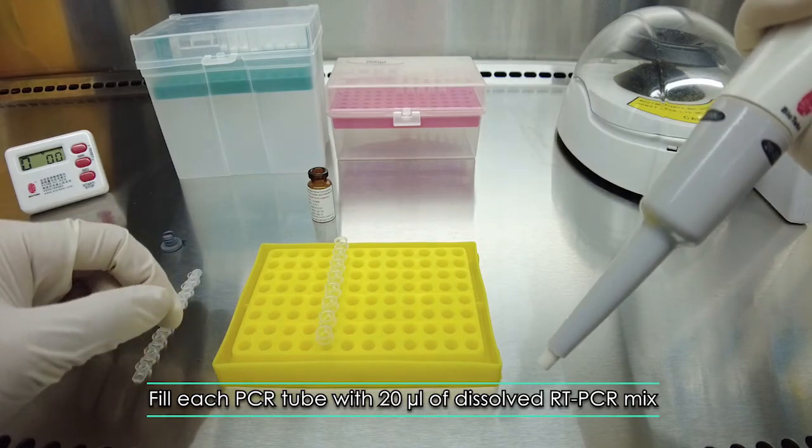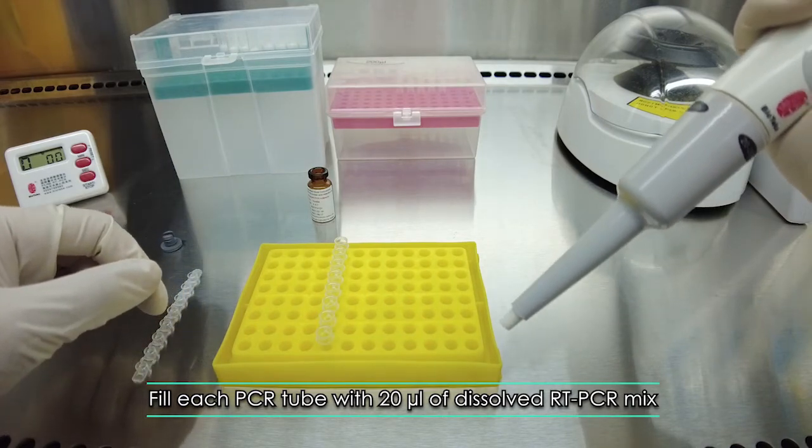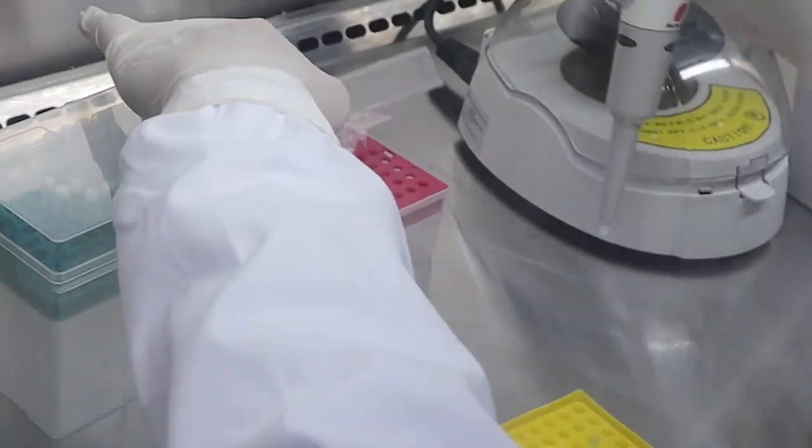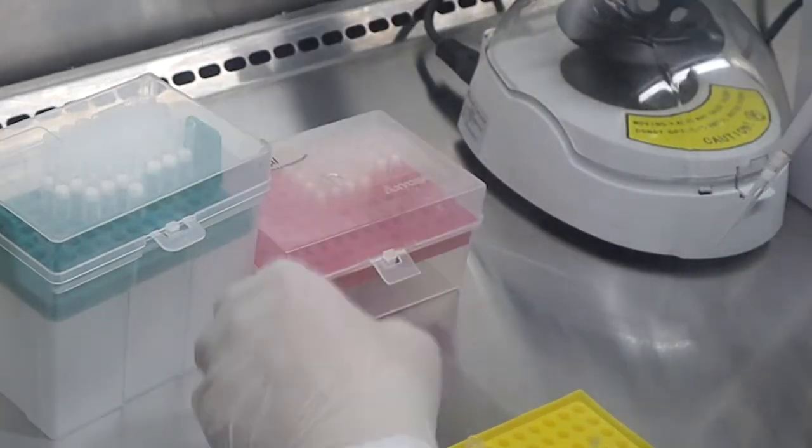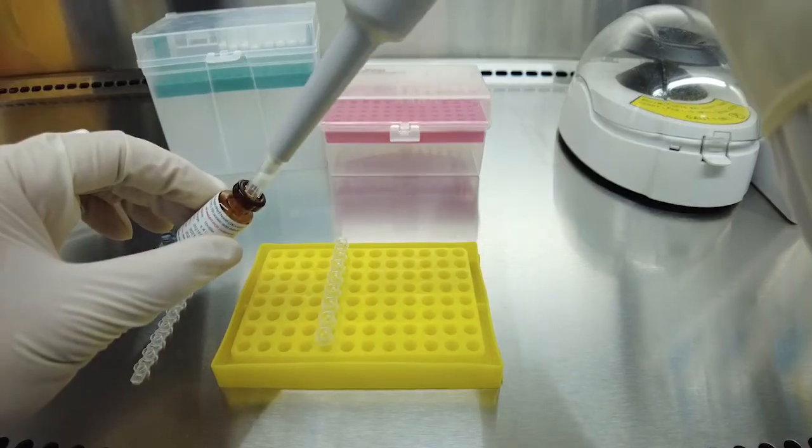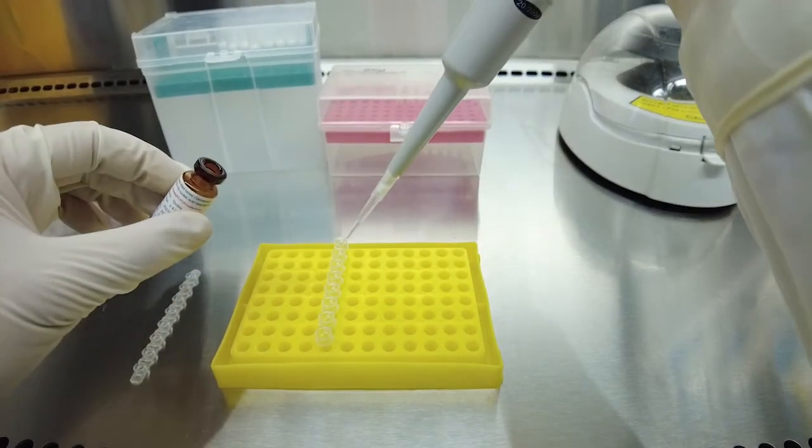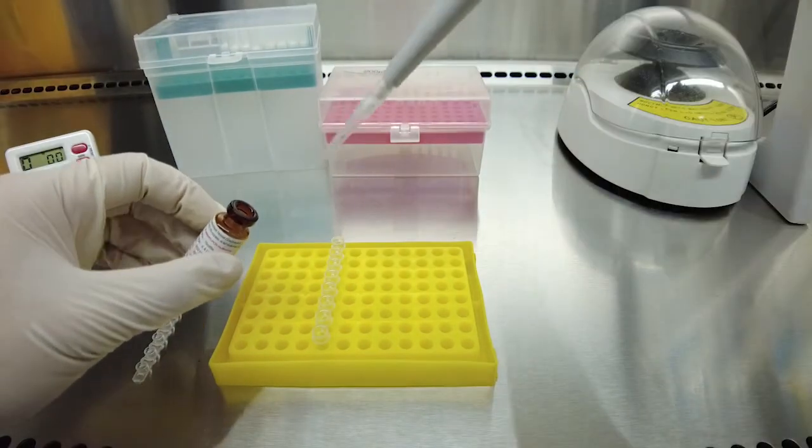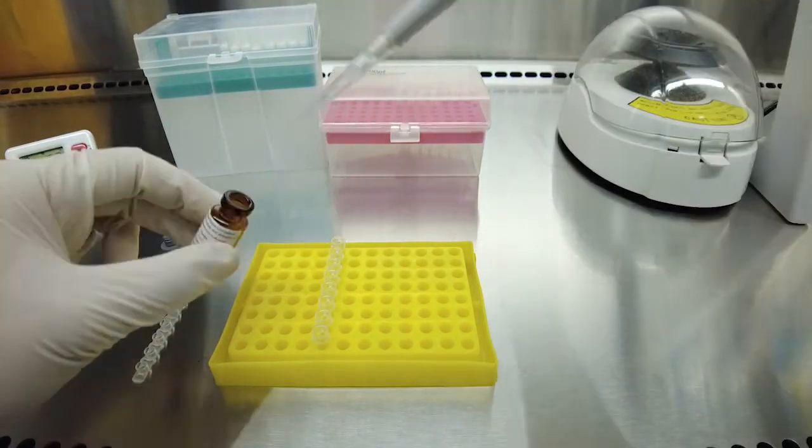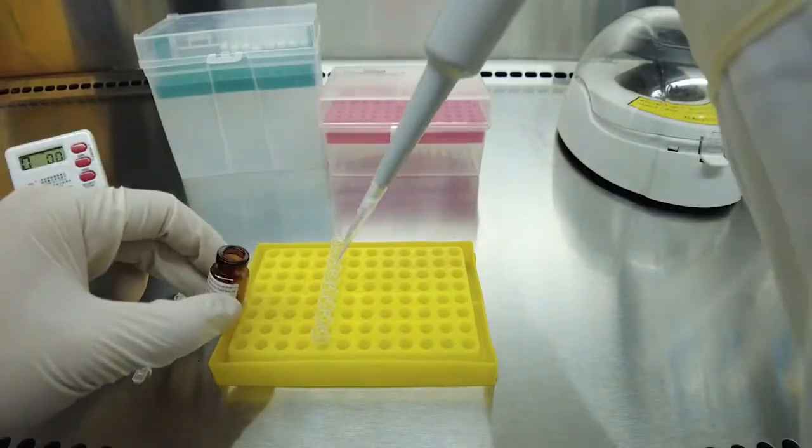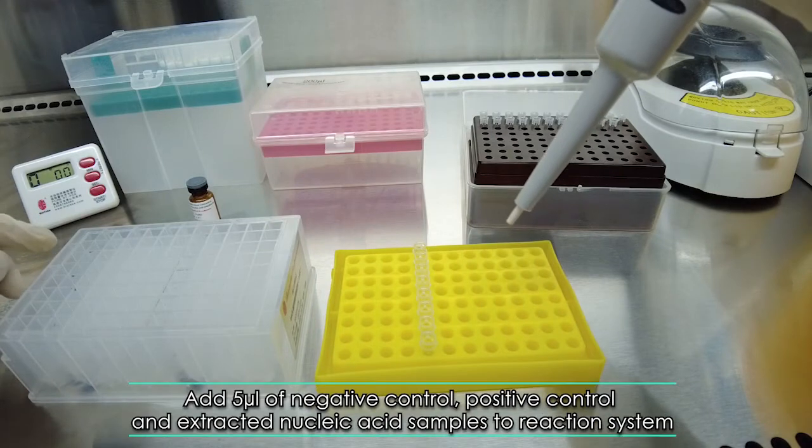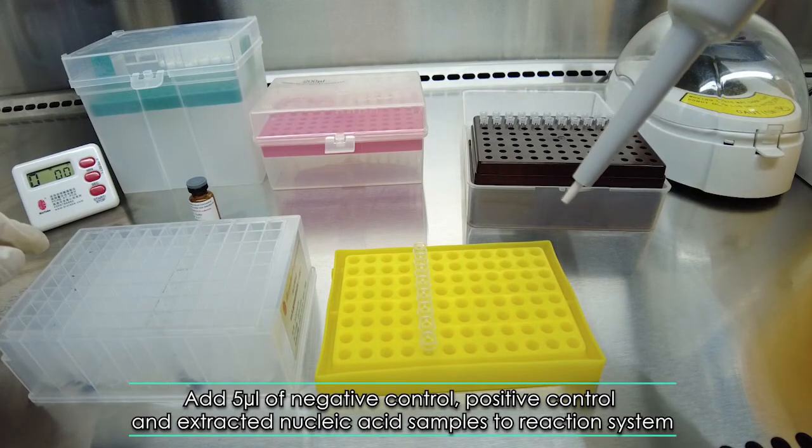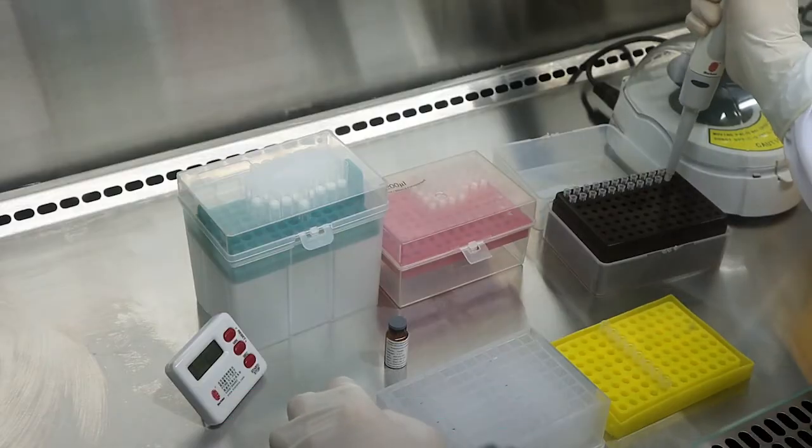Fill each PCR tube with 20 microliters of dissolved RT-PCR mix. Add five microliters of negative control, positive control, and extracted nucleic acid samples to the reaction system.